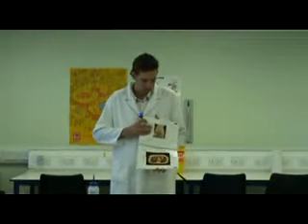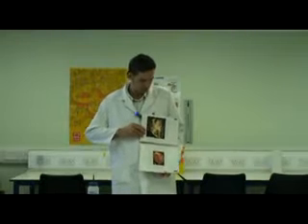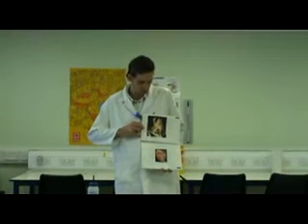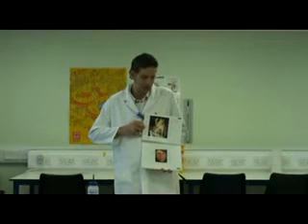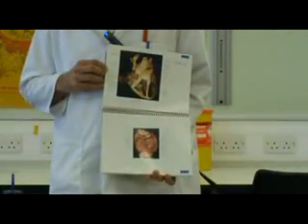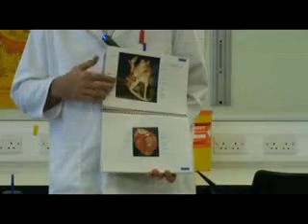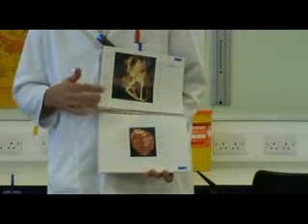For example, the heart itself, shown in the pictures here, has been dissected to show a variety of structures. And what's nice about these images is that the sections and the views are indicated on each of the diagrams. Here, illustrated in this book, is a picture of the heart, and its view is shown below.